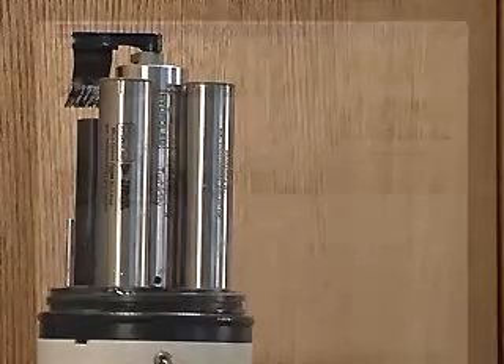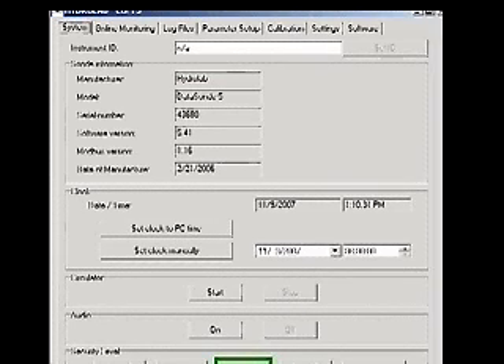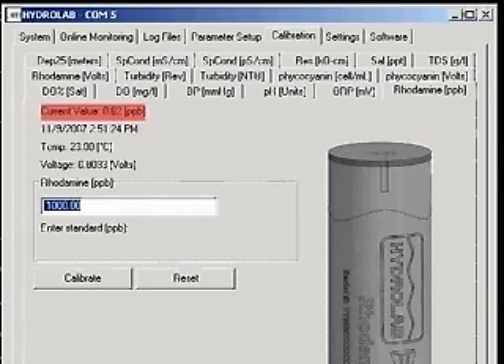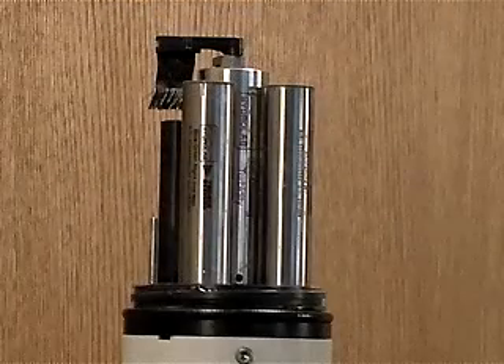Calibration. Establish a connection to the Sonde with Hydrus 3LT. Click the button labeled Operate Sonde. When the Sonde finishes its initialization, click the Calibration tab, then click the Rhodamine PPB tab. You will see a picture of the fluorometer as well as the current value, the date and time, the current temperature, and the voltage reading of the sensor. Begin with a clean and dry Sonde.